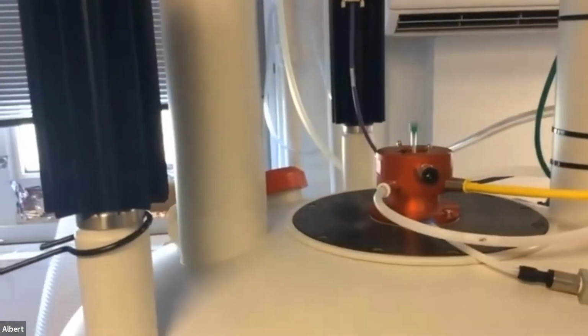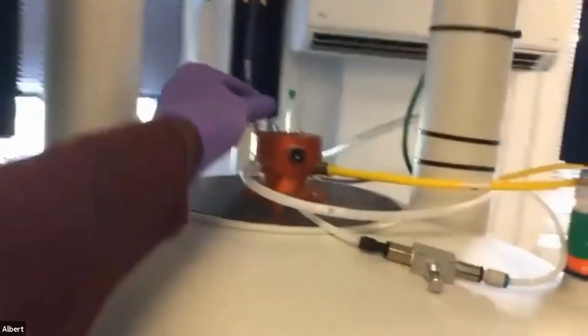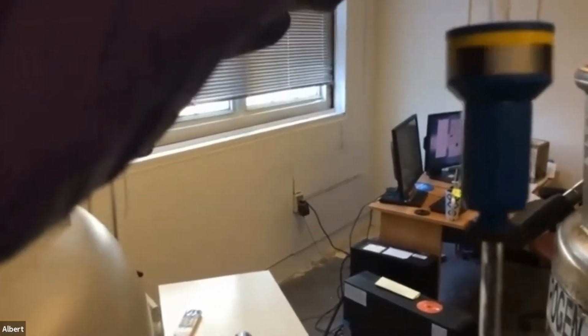And let me show you over here. You're going to see the sample that was in there pop up. All right, so that sample has popped up. So I'm going to take that out. You can see that it's on a spinner. Let me see if I get the camera right. There's a spinner here. All right, and it has some black and white panels on it, and that's on purpose because when the sample is inside the instrument, you have to spin it in order to homogenize the radiation that's hitting, right? So that's just to keep track of the RPM.